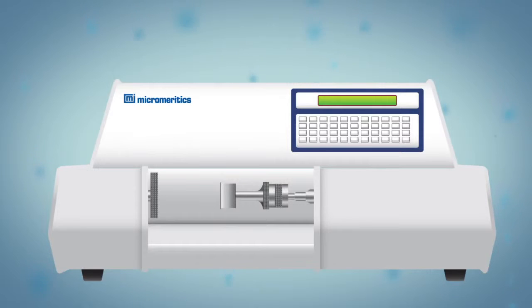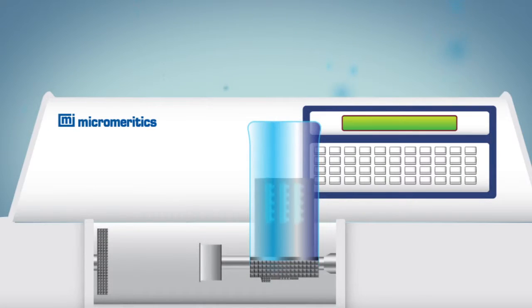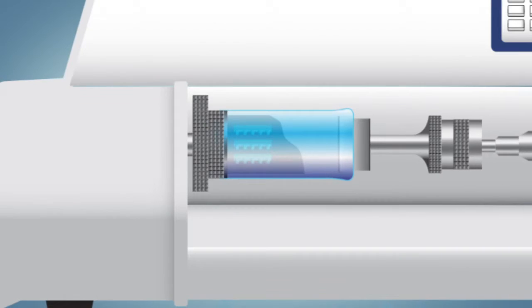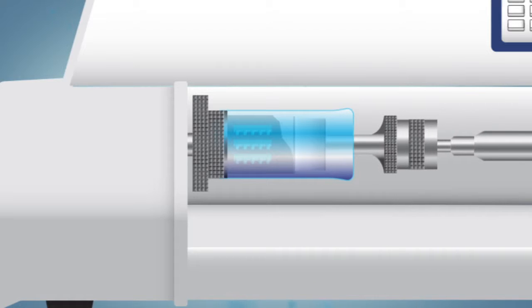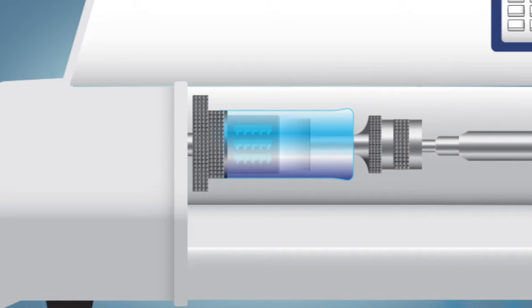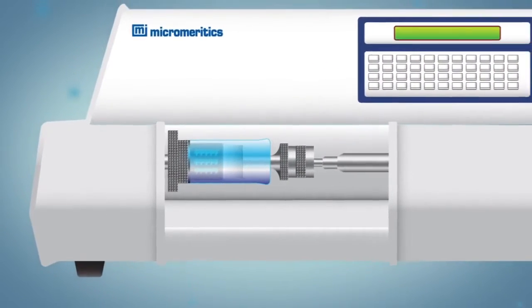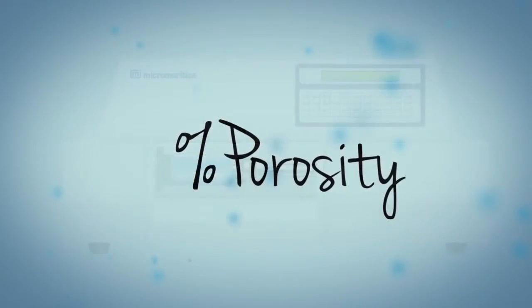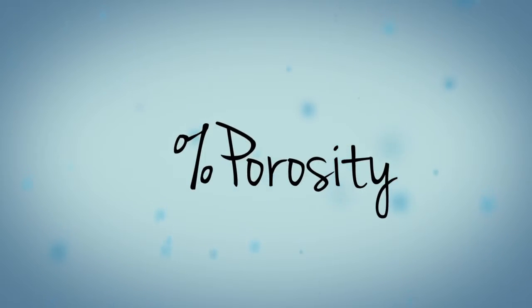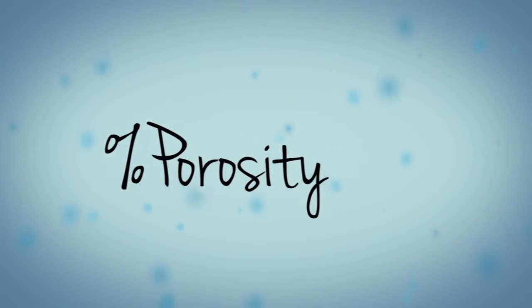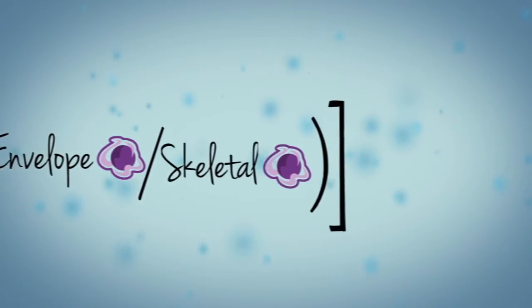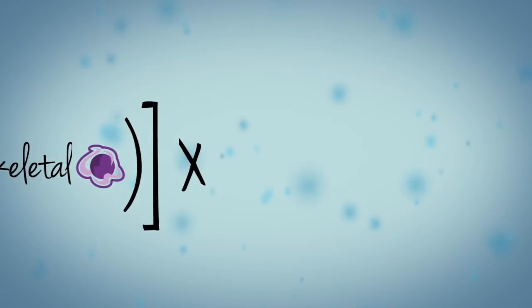The GeoPyc is used to measure envelope density. A ribbon is placed into a quasi-fluid medium that has a high degree of flowability. The ribbon and medium are then gently agitated, compressed, and displacement measurements are taken. When skeletal density measurements are entered into the GeoPyc, along with sample mass, the percent porosity of the ribbon is then calculated. Percent porosity equals 1 minus envelope density over skeletal density multiplied by 100.